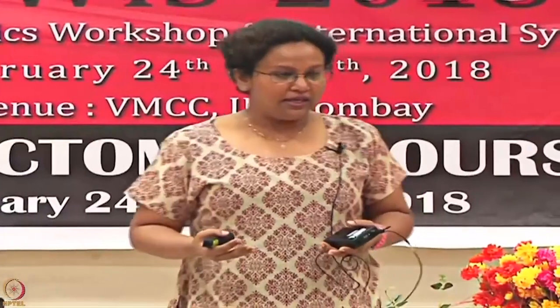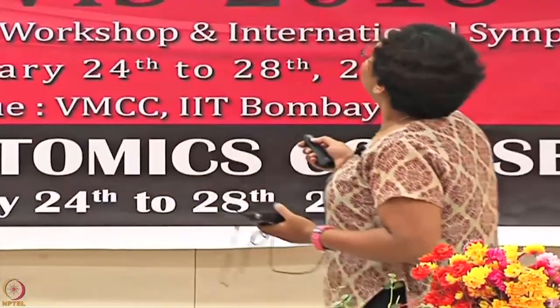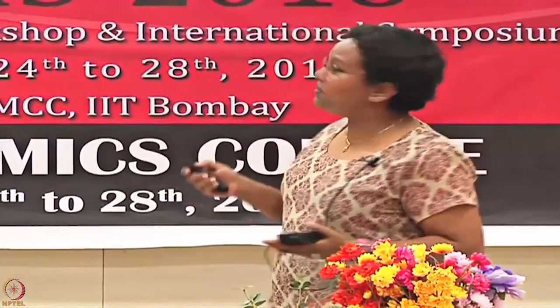Does that mean that pH 4 is the best for immobilization? Most people think that the lower the pH we go, the more we can attract the protein and eventually we can get the best. Well, there is some amount of truth in that, but not always. If you see out here in pH 5.5, which is actually the highest pH here, you attain quite a large amount of RUs.